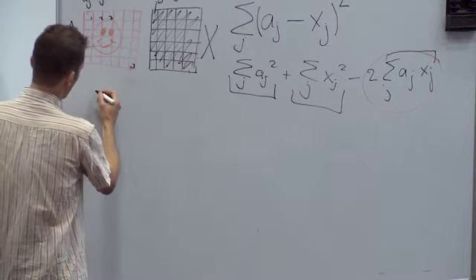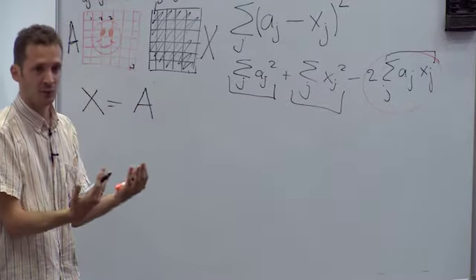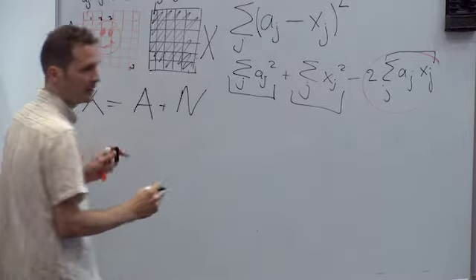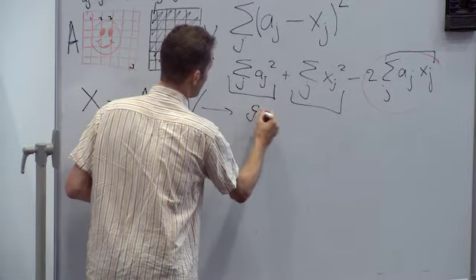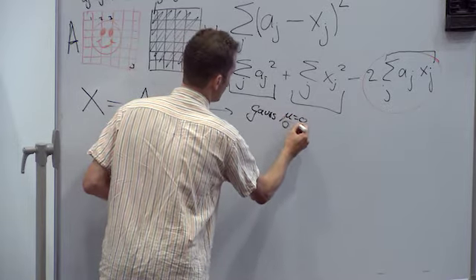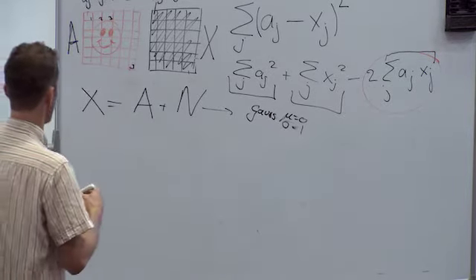The underlying data model is that our experimental image is the summation of the actual true signal plus a noise image. And the noise, we're going to assume that it's Gaussian distributed with a mean of 0 and a given standard deviation, and then we normalize these images so we can assume that the standard deviation is 1 in them.